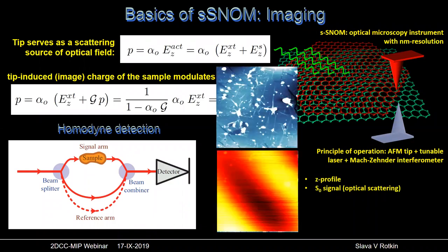Now, if you look at the reflection from this sample, just optical reflection, you can see bright and dark lines. And this is the interference pattern that I mentioned to you before. Here they interfere destructively, here they interfere constructively, but you don't get much signal from the sample that will tell you about the material's properties, or give a better image than the atomic force microscope.